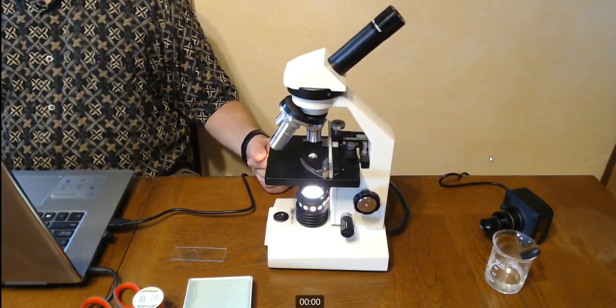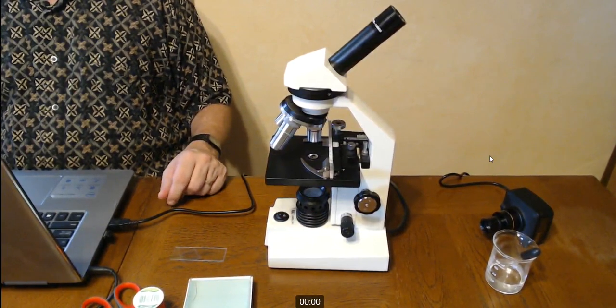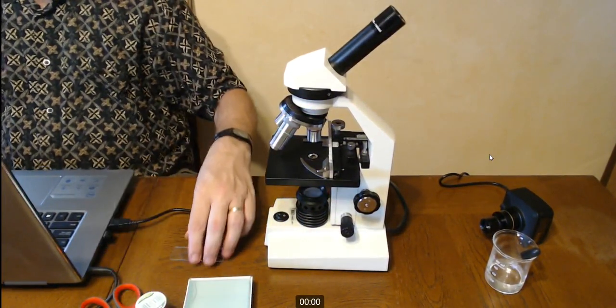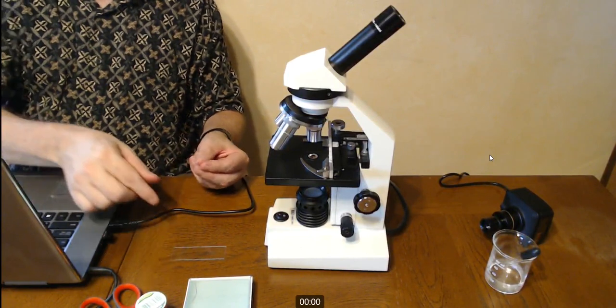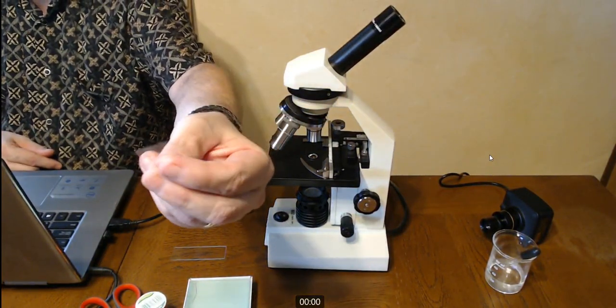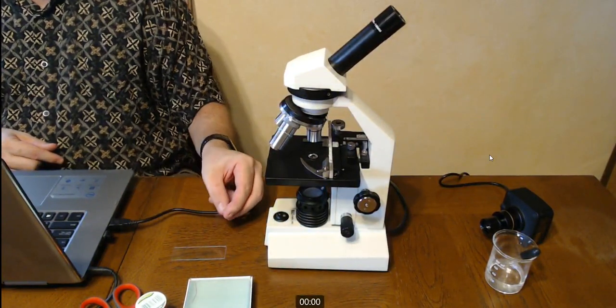There you go. Okay, we're going to look at a slide. I've got some red thread here, so I cut a piece of the red thread. We're going to create a wet slide with the thread using a slide and a cover slip. A cover slip is a very thin piece of glass, you can't even see it.